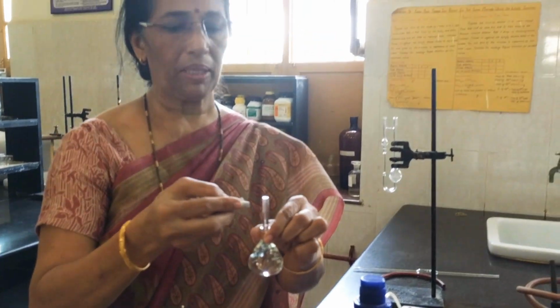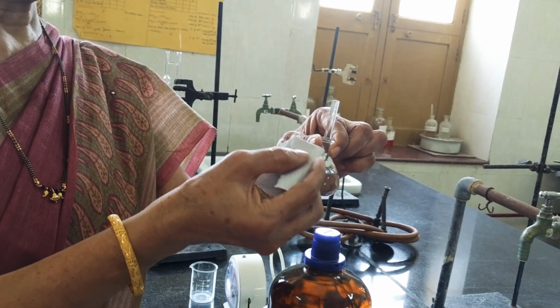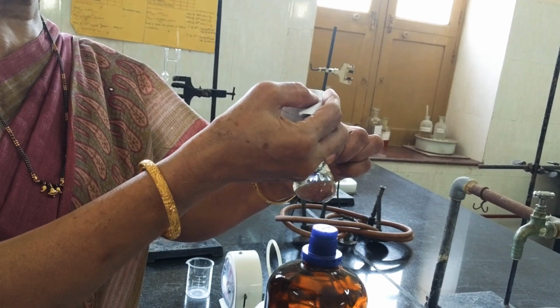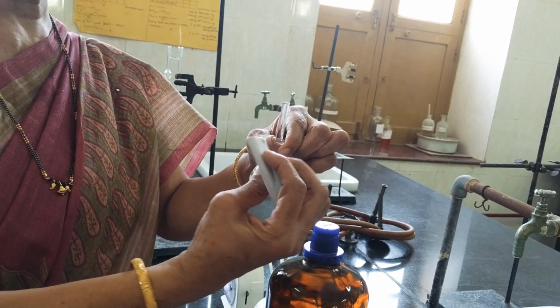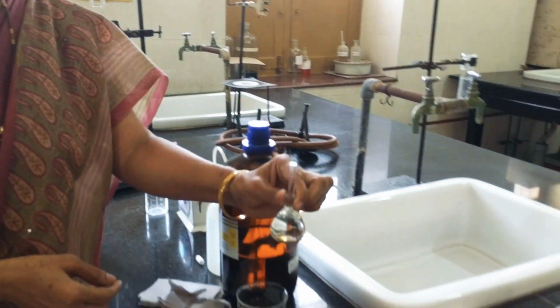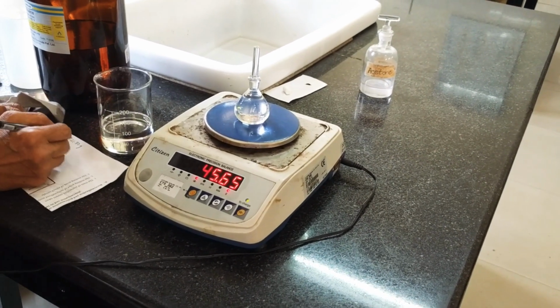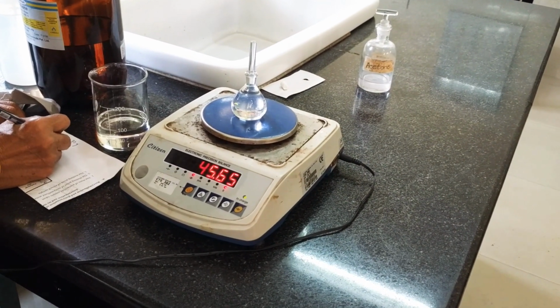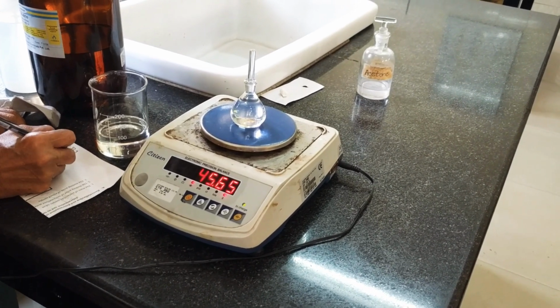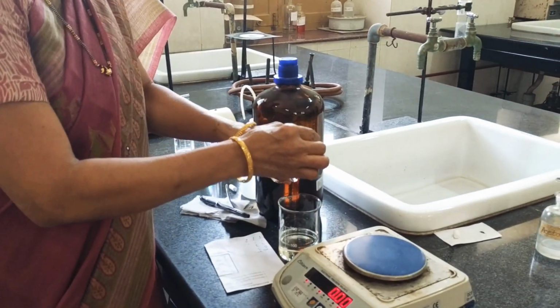Now I don't wipe for a long period on the top. I take a quick wipe like that, because if I hold the paper for a longer period, the liquid is going to get sucked into the paper. Now this is ready. I will place it on the balance and take down my second mass, that is 45.65 grams. You are not going to waste this liquid. Pour it back.